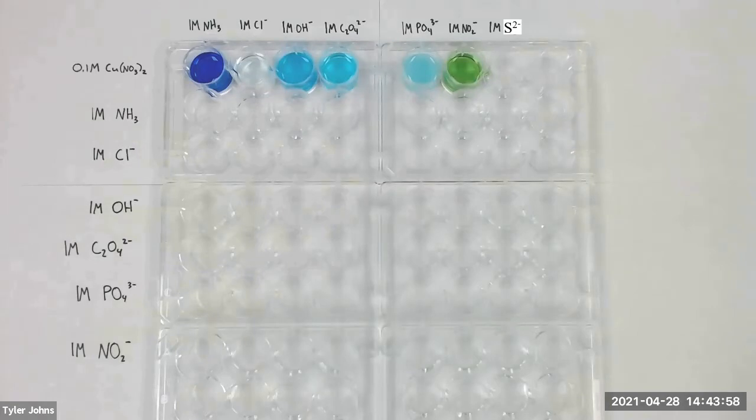We will mix the reagents and note any changes that occur upon the addition of ammonia. Changes that occur indicate a reaction to form a more stable species. Use the reference wells in the top row for comparison.